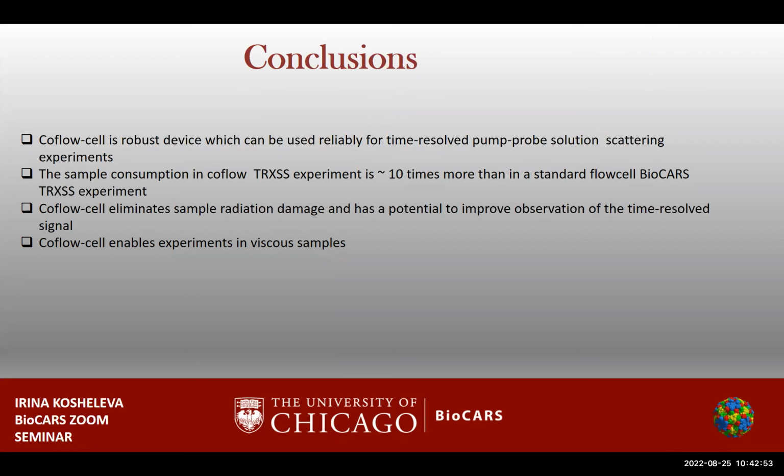Yeah, I mean, there's Fluorinert, isn't it? It's completely non-flammable, completely inert, non-toxic. It just evaporates like water. There's no need to recover it. This is actually great. So when you don't need to recover your sample, that might be an interesting solution. I will talk to you later, Friedrich, just to see what you know, the properties of this organic solvent.